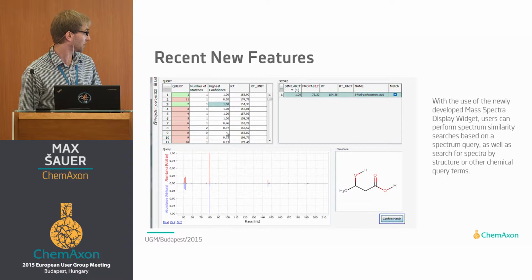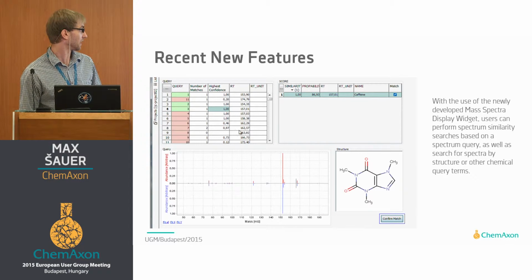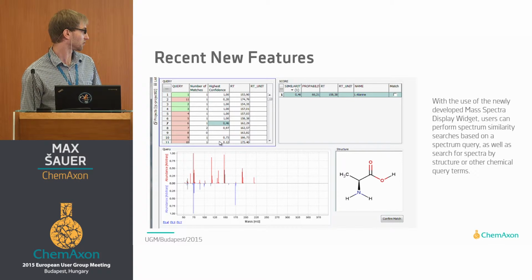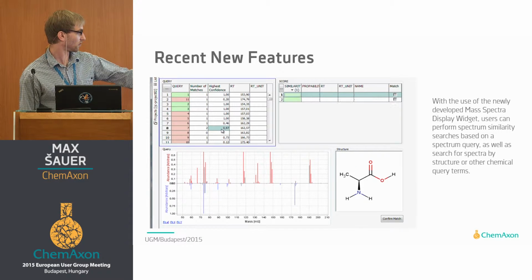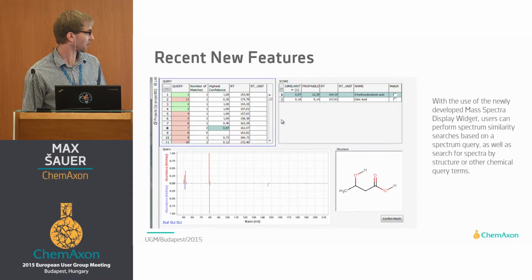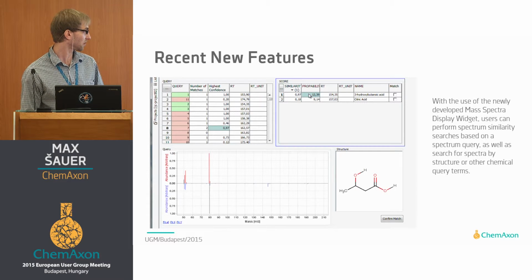You can confirm your matches and perform both similarity searches and spectrum queries combined, which is quite a novel thing. You can analyze those peaks, and once you are done, you can confirm a match. It will show in the video right after the confirm match action, on the bottom right. If you invoke the action, it will actually change the data and save the match into the database.